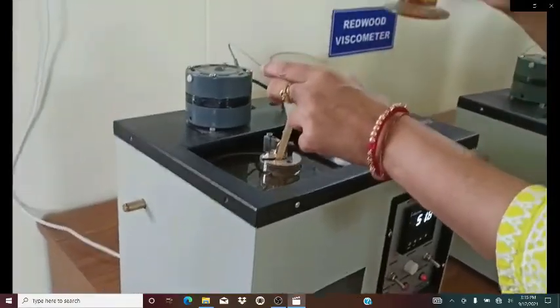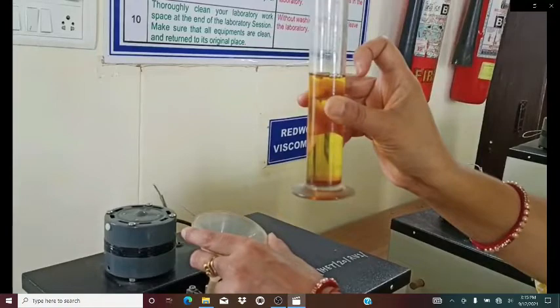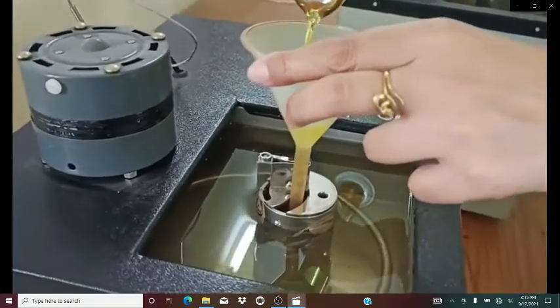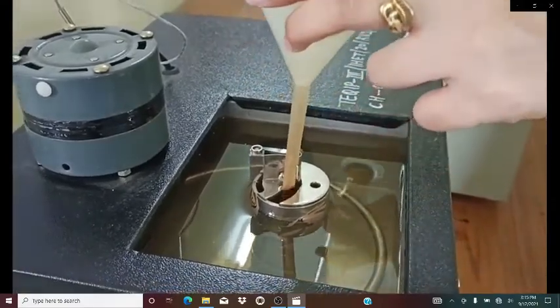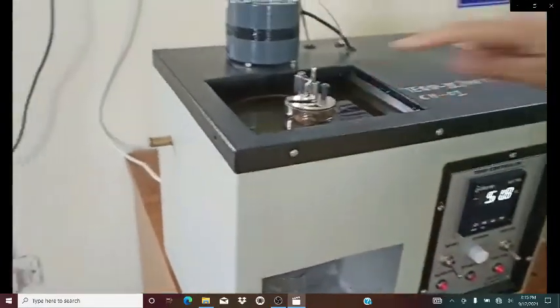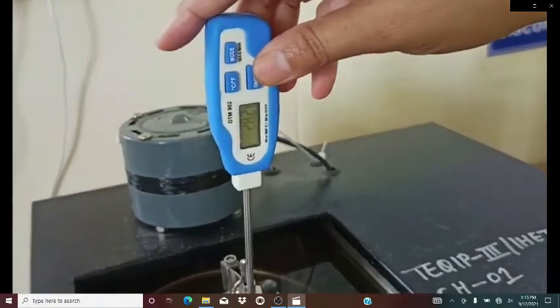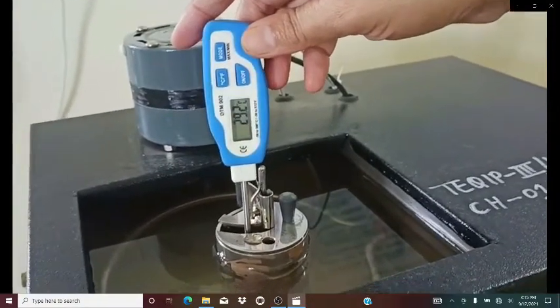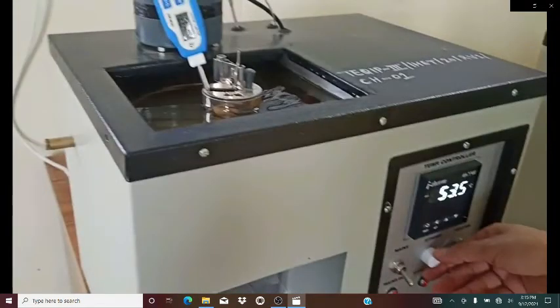In this cylindrical vessel, which has a nozzle at the bottom, we fill the lubricating oil to the 50 ml mark. Since the lid is covered and the nozzle is also covered, the oil is not flowing until we disturb the nozzle. Now we measure the temperature of the lubricating oil — that is important. This outer water is used to heat up the lubricating oil.